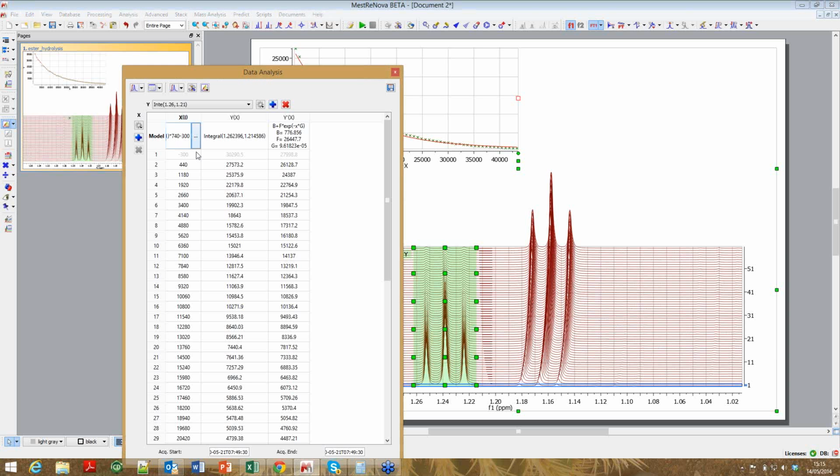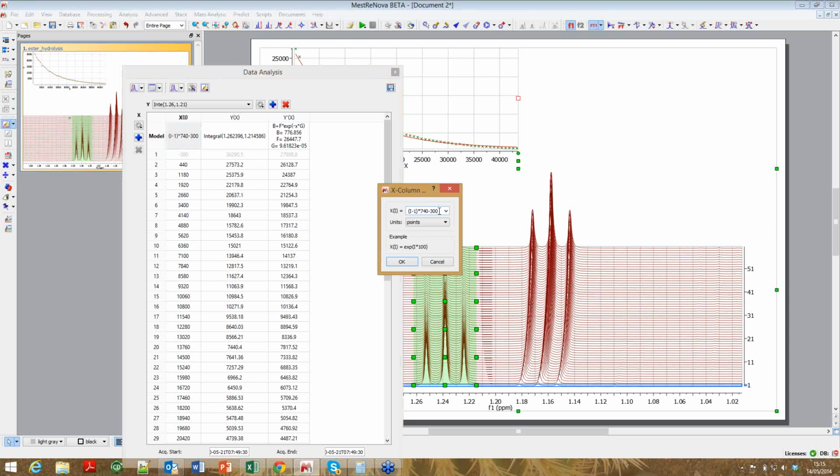So that's a manipulation of the time axis using the index and whatever you like. So let's take away that 300. I don't like it. So I should have put a bracket there.